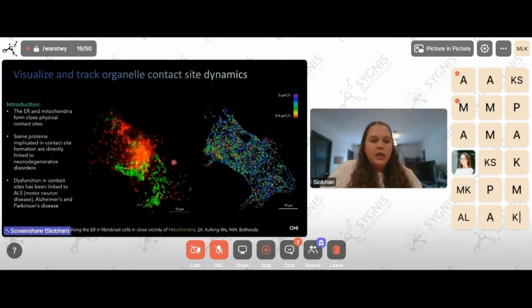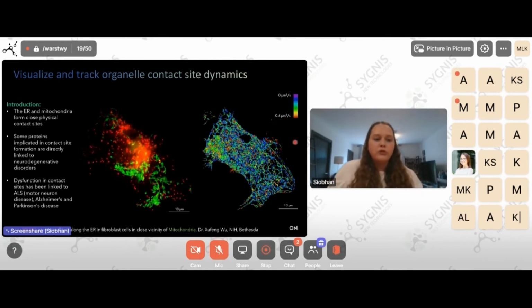You can see here that the mitochondria has been labeled in green in the background. So you can see that we can actually look at this system in 2 colors. On the right-hand side, we're looking at the single particle tracks, which are being built up as these particles and proteins are moving within the cell, and we can color their output on diffusion coefficient. So you get the speed of these proteins moving within the cell as well.